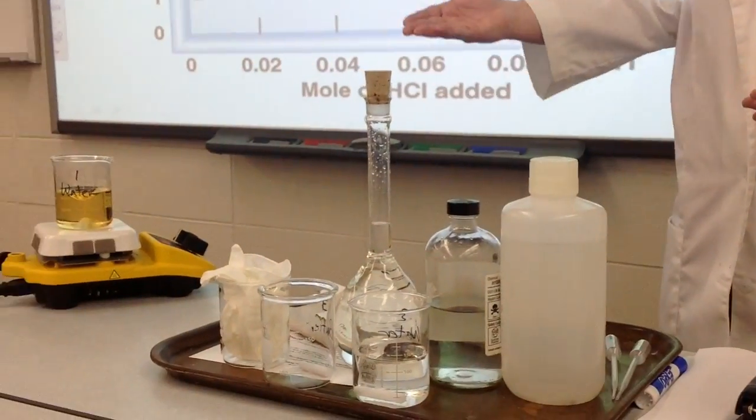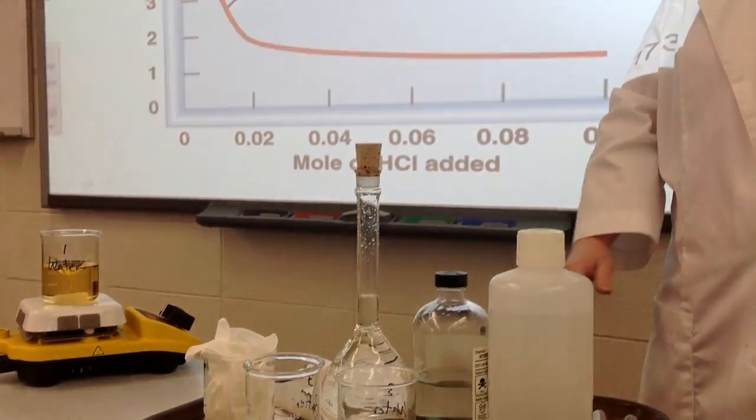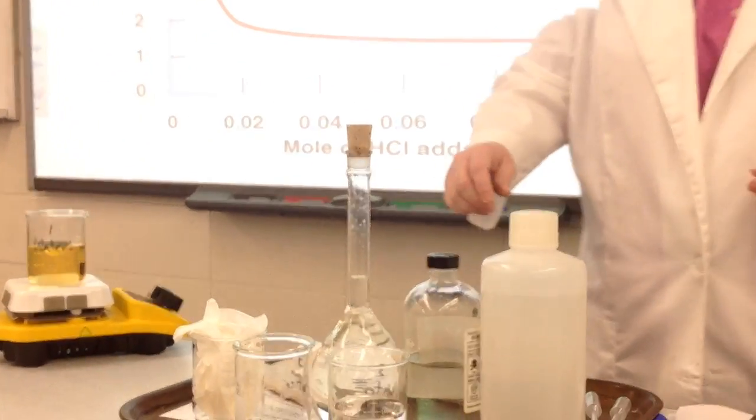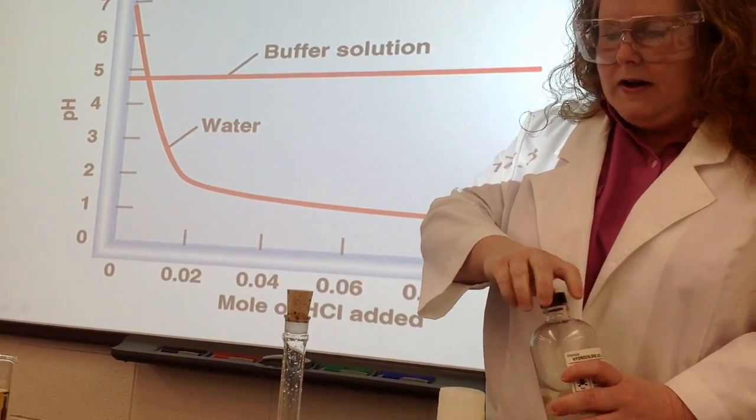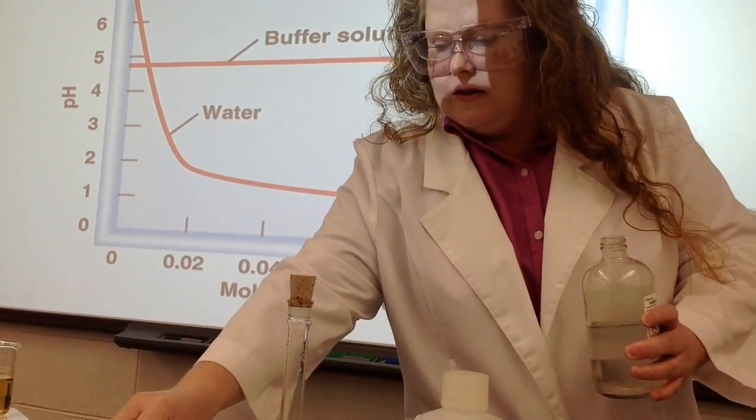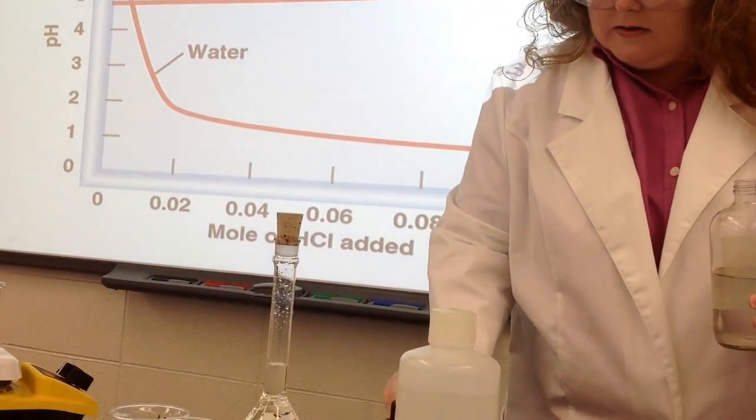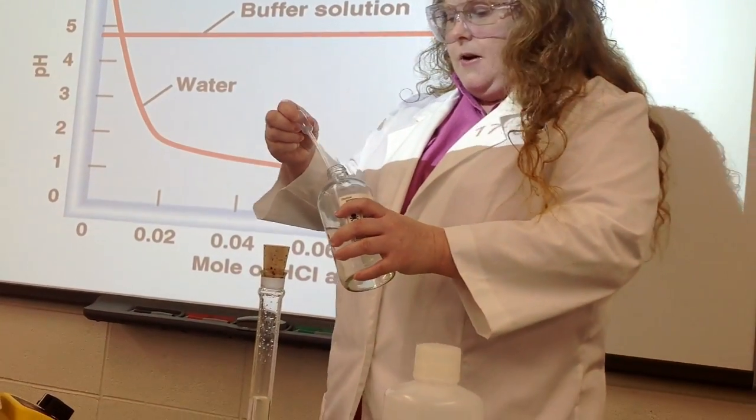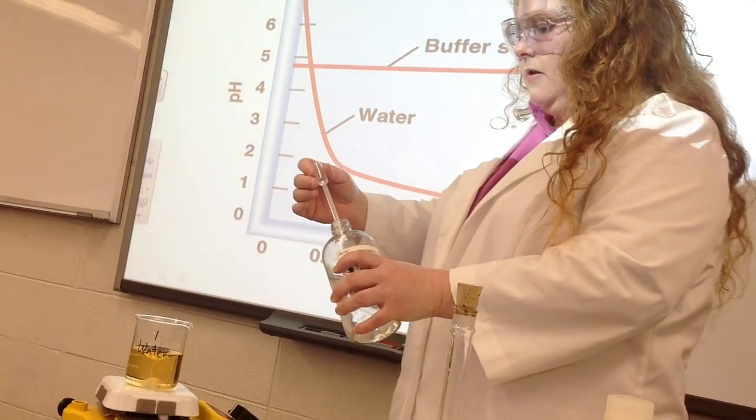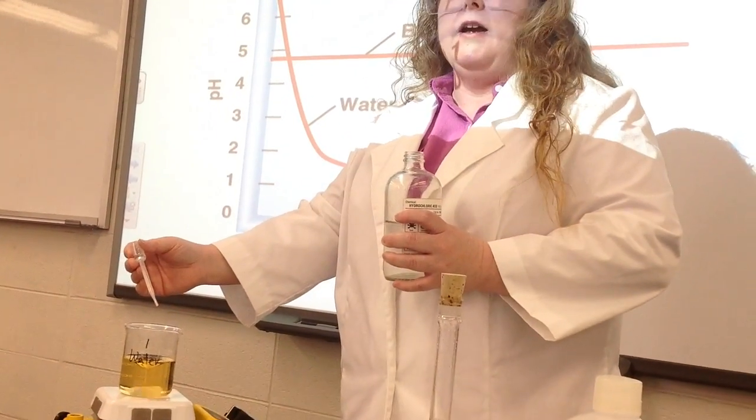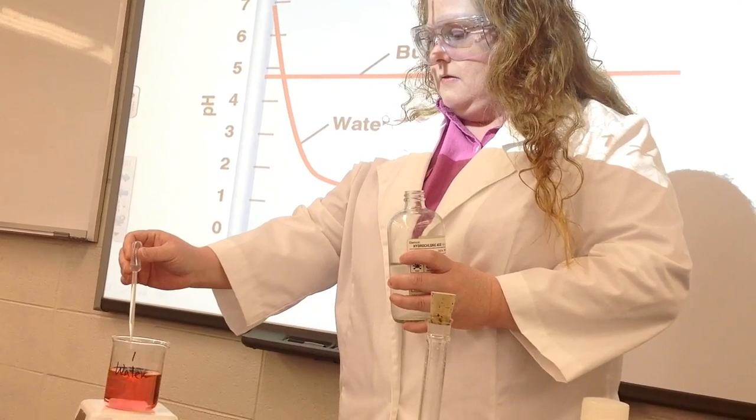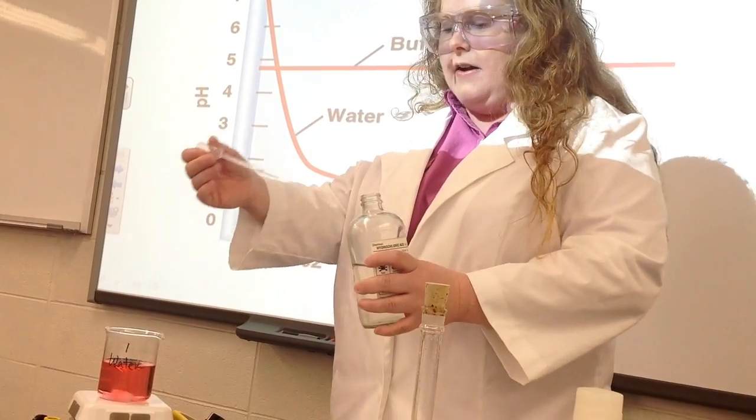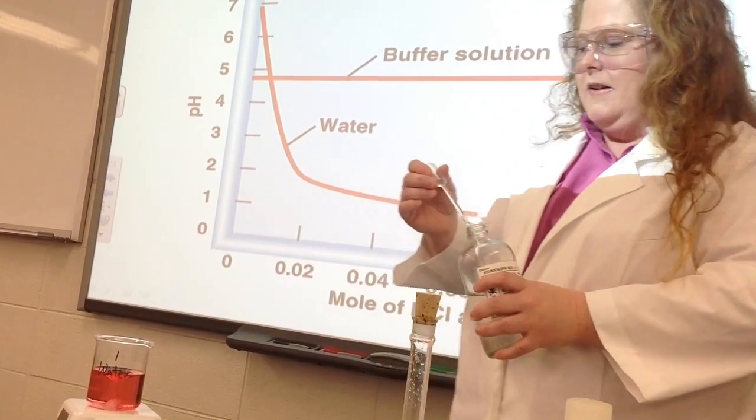So this indicator around five pH is yellow. Okay, let's see what will happen. I've got some one molar hydrochloric acid, and so let's take a pipette of this and add to the water. Now if the pH changes we should see a color change. Okay, all right, I only added a few drops by the way and you can see what happened - it's pink.